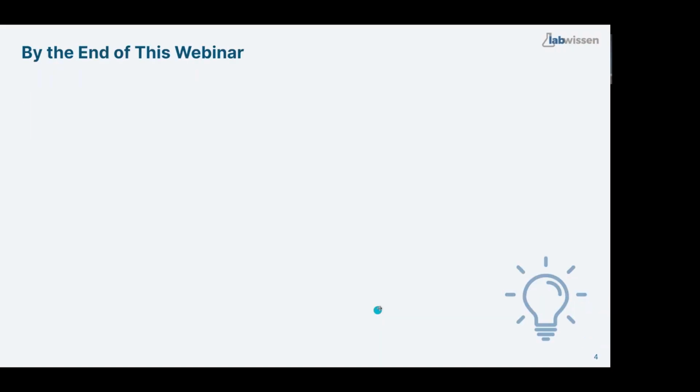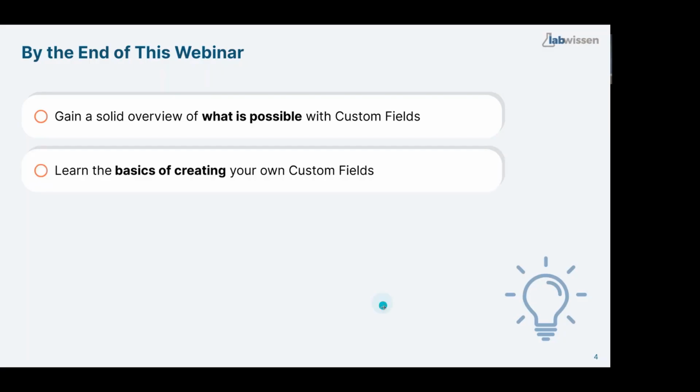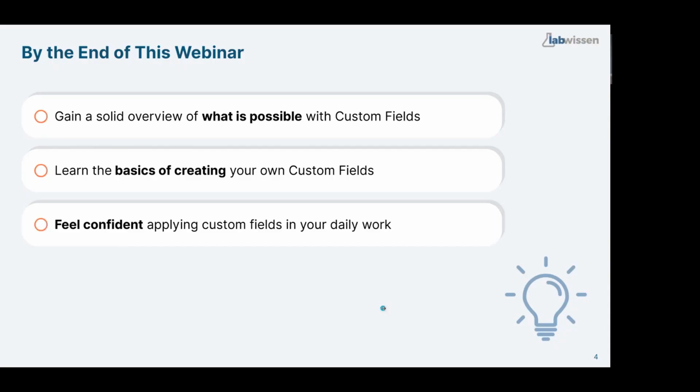So by the end of this webinar, you're going to gain a solid overview of what is possible with custom fields. You will learn the basics of creating your own custom fields, and you will feel confident applying custom fields in your daily work.